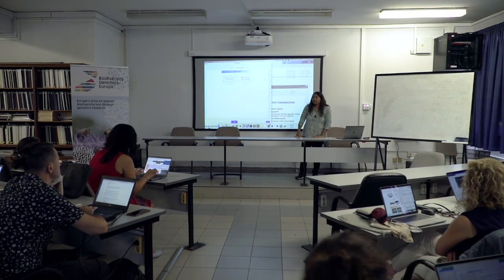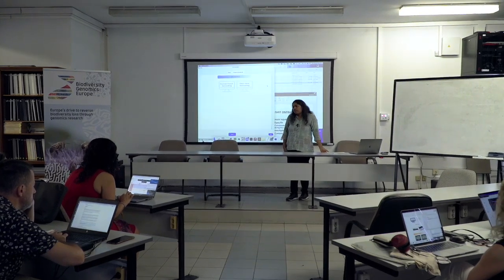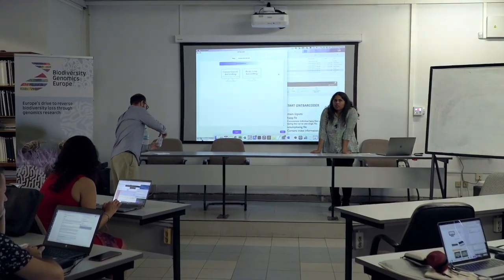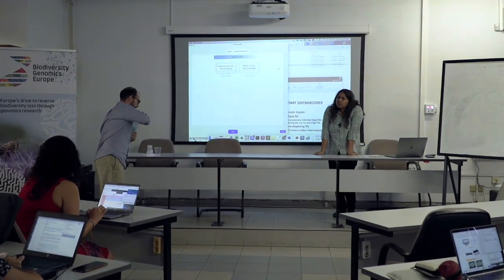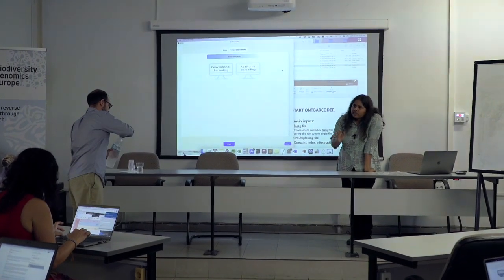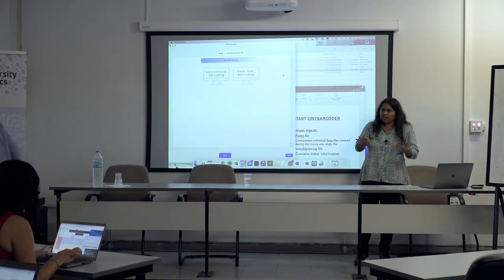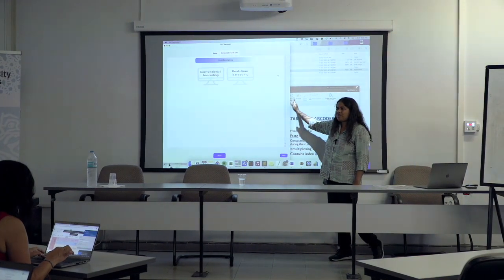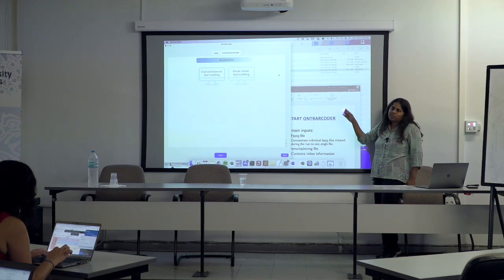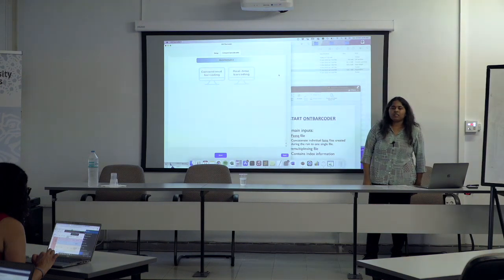So yeah, you use the failed reads as well? Because we only ever use the pass reads. We usually use the fail reads. There's a lot of literature on this, that Q scores in MinION were not really mattering. Demultiplexing rate does differ in that sense, so there is some difference overall in the accuracy of the read, but positionally, in the SNPs, the Q score was not impacting the consensus.